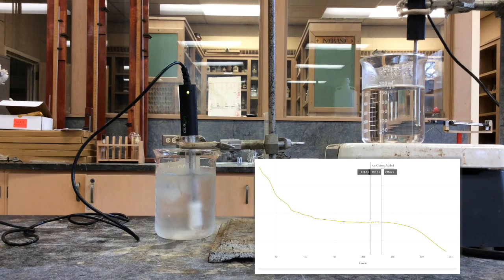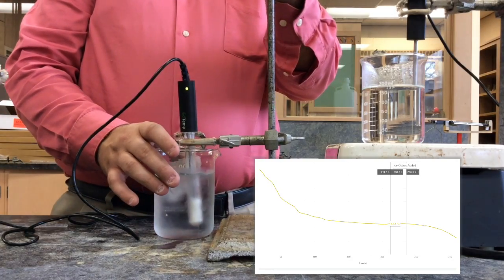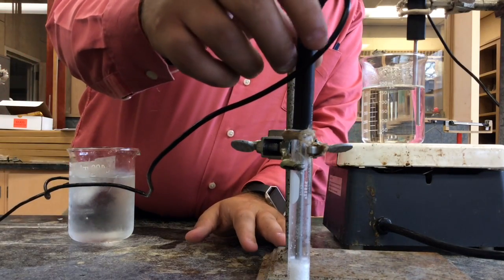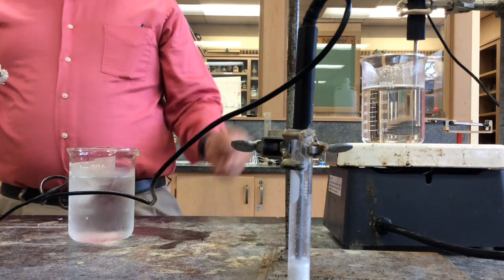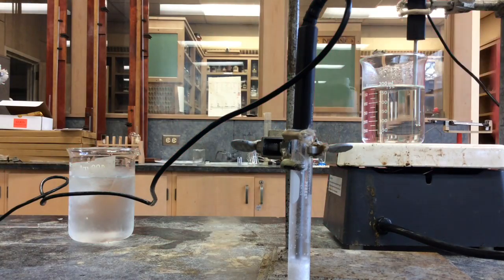Right now it's about room temperature, and I'm just going to go ahead and stop it, just like that. And I do want to show you what the solid looks like. And so I'm going to take this out, and I'll show you here. There's that white solid that used to be a liquid. And I try and pull my Go Temp out, and it's not budging. So the graph, I'll put a picture at the end, but this is a successful cooling curve.